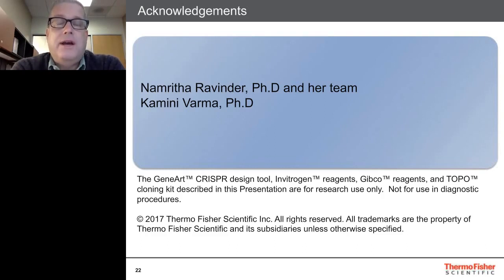So again, it depends on the nature of your laboratory and the type of questions you want to ask. Next-gen sequencing can be used to quantify the types of edits that you have made and the types of sequences that you have present. But again, going through the workflow and the expense sometimes is not the most efficient way to go about it. But certainly, next-generation sequencing is a valuable tool that can be used for genome editing workflows.